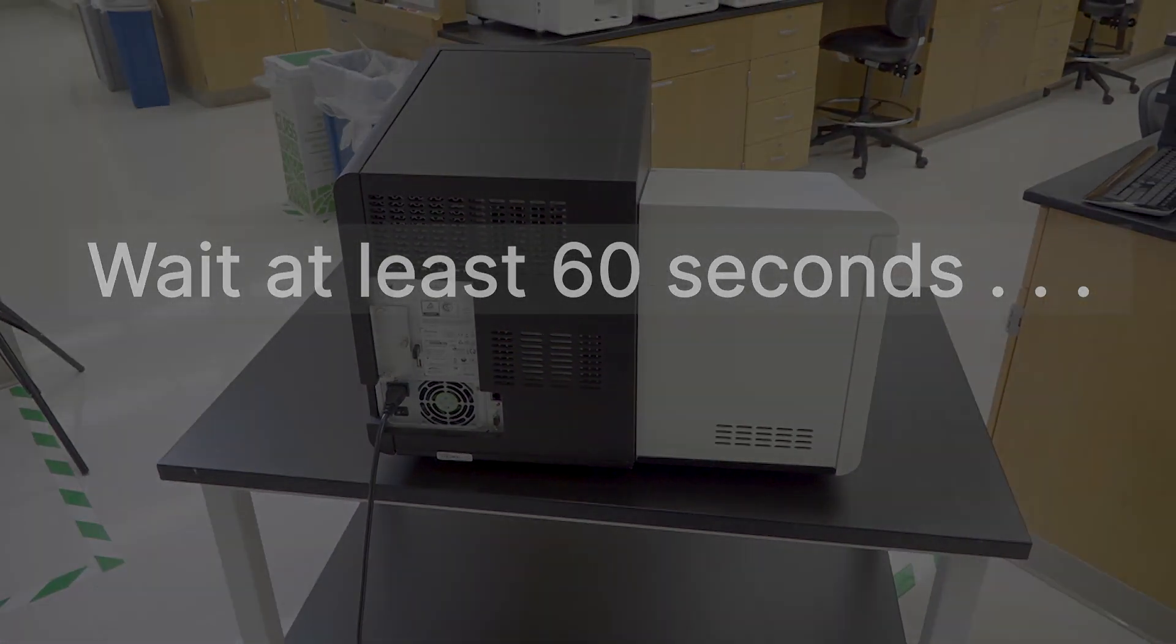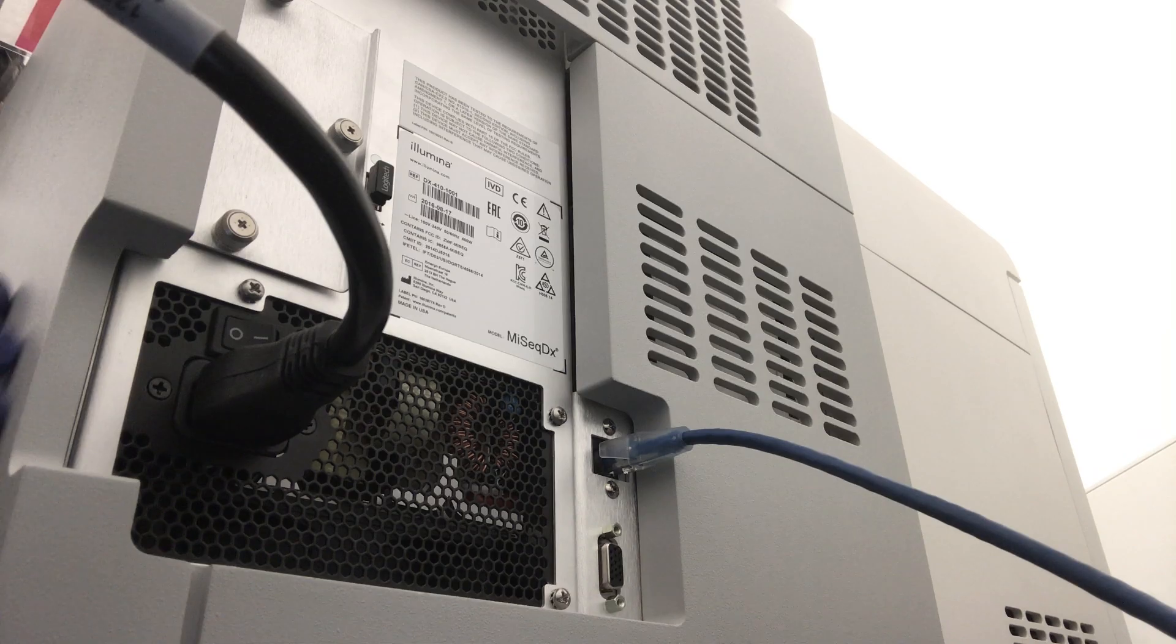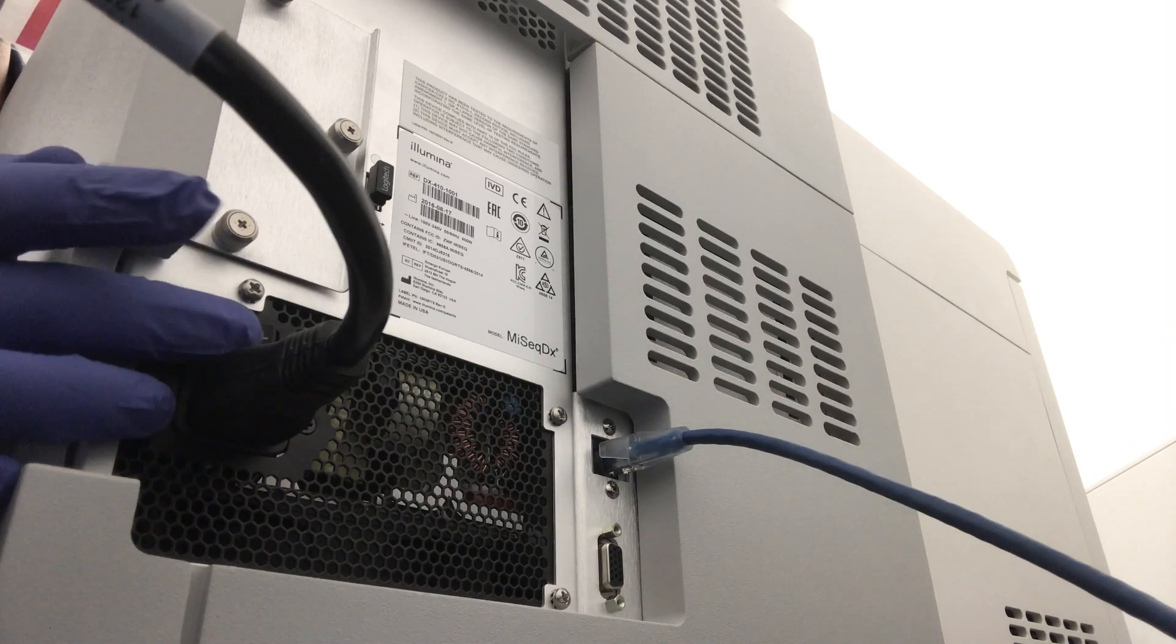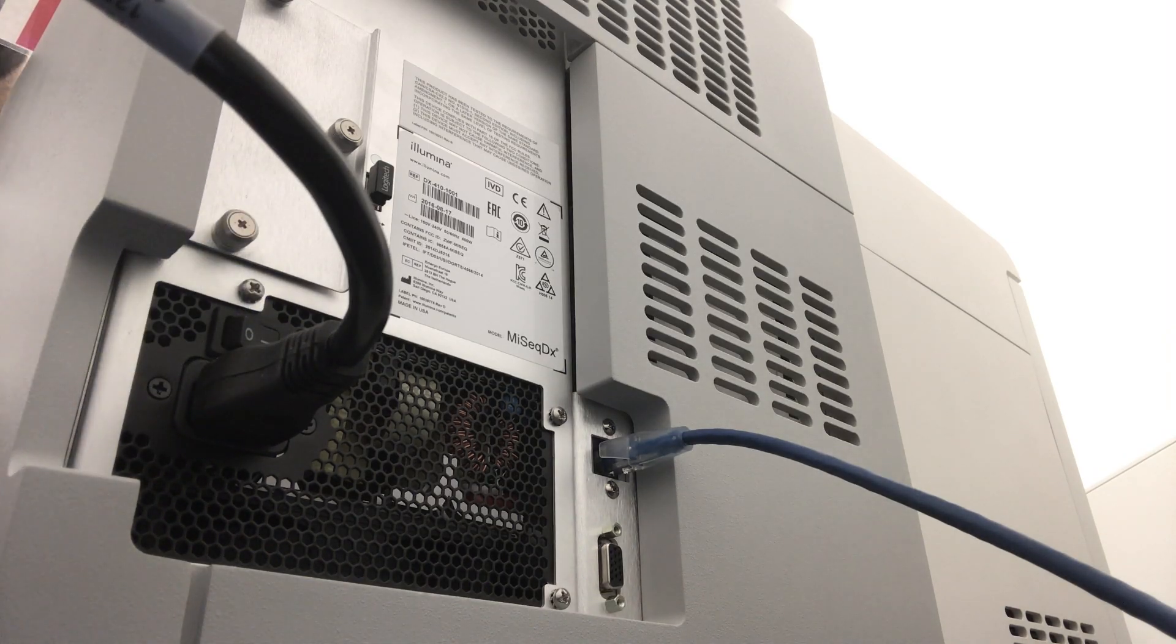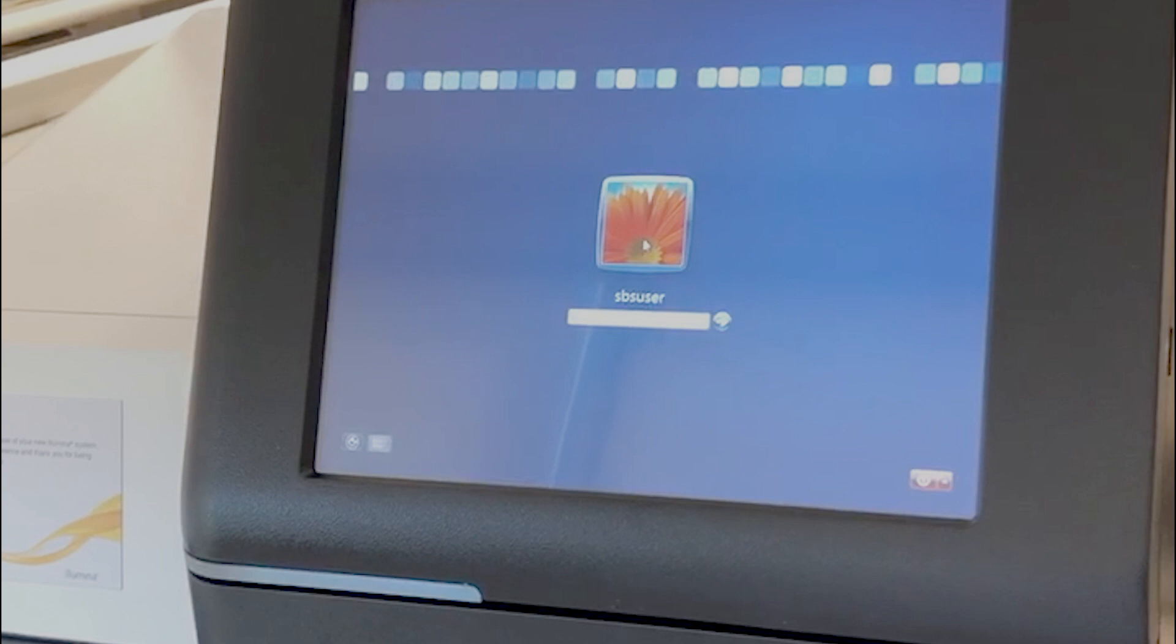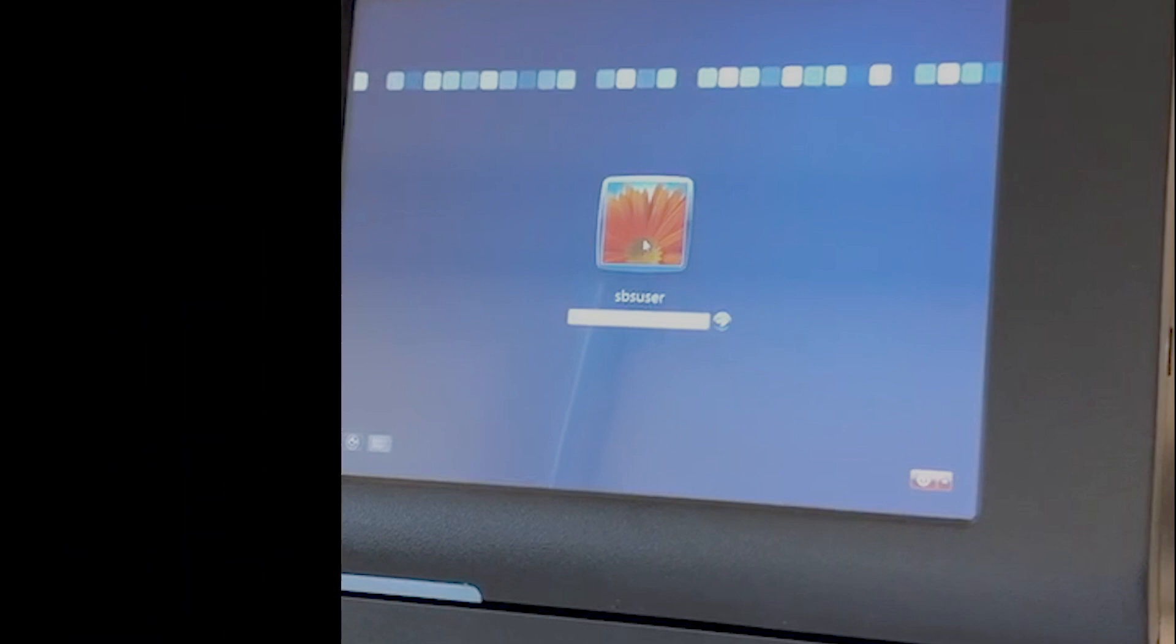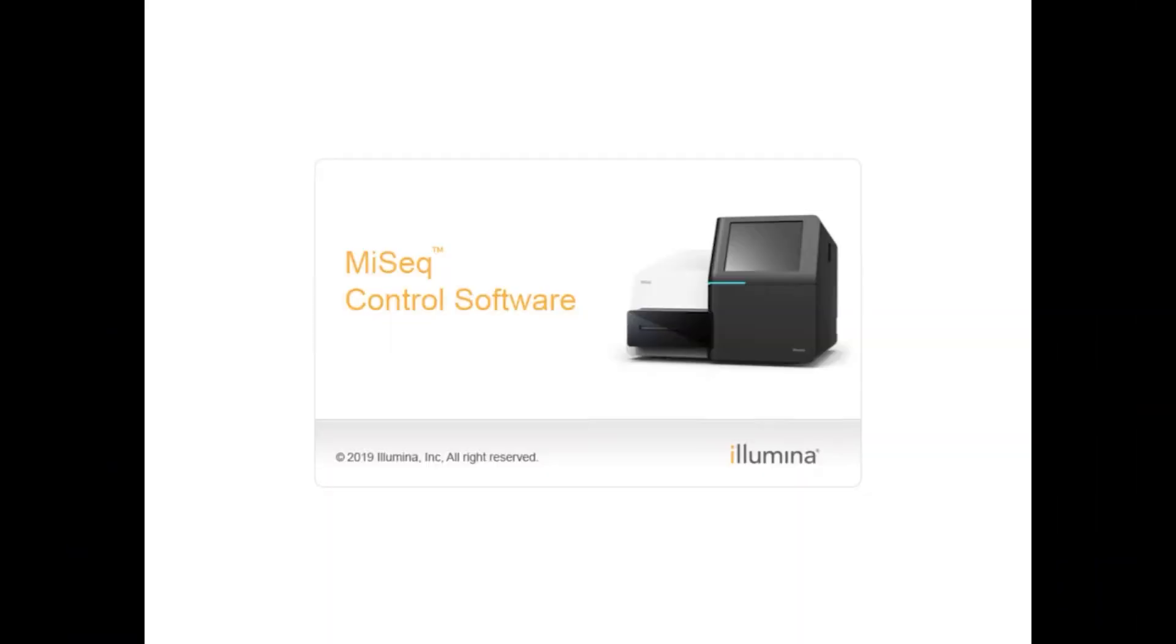After three minutes, turn the power switch back on. The instrument computer will boot automatically. Then log into the Windows account and wait for the instrument control software to initialize.